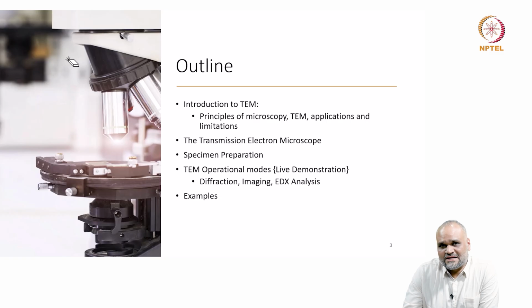I'm not sure what exactly is the very correct way to get an image from an instrument, but I'll at least tell you what are the do's and don'ts and the basic first level troubleshooting to help you get information. We'll start with looking at a lanthanum hexaboride TEM, and then I'll show you the alignment procedure, the loading of the specimen, getting some basic images.